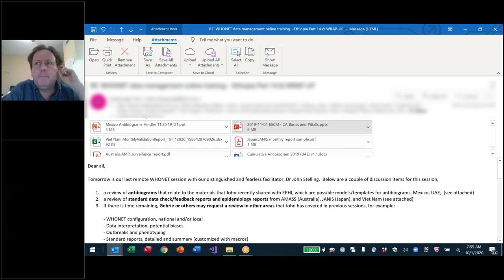So at a minimum, for routine surveillance, I would suggest a patient identifier, perhaps the patient's name if you're doing the clinical reporting, age and gender, and date of birth if you have it. One advantage of date of birth is it can tell you the age. Another advantage is you can use it to find out if two people with the same name are in fact the same person. So this is the minimum I would require for routine data collection for patient-level data.